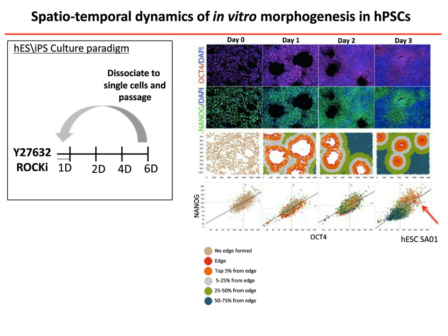Below, in the scatter plot, we're plotting the relative signals from OCT4 on the x-axis and from NANOG on the y-axis. Although the relative signals through time in the colony don't change that much, the cells that have high levels do. In the third row, I'm representing the same cells that you see in the top two rows as XY positions, and they're colored based on distance from the colony edge, where red is closest to the edge, orange is a little further away, etc.